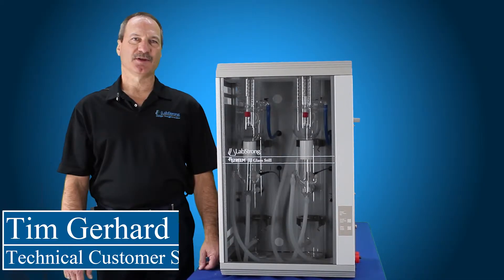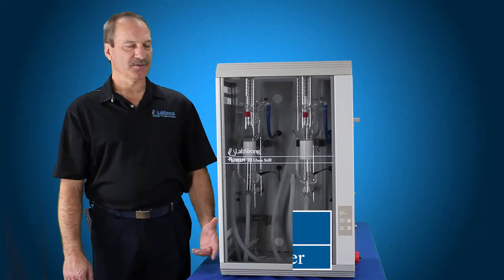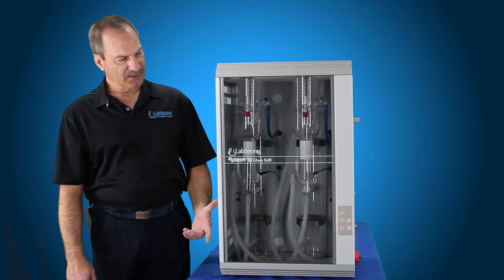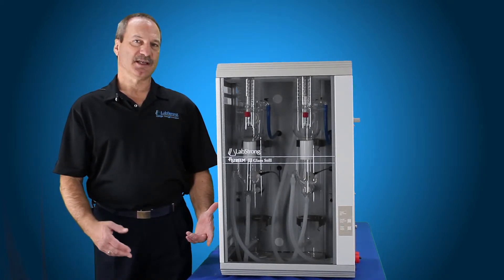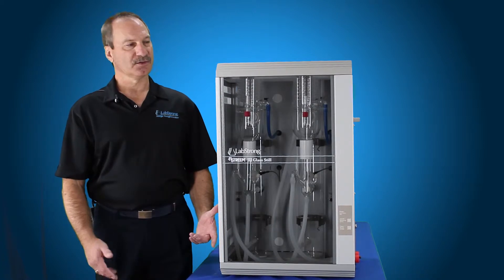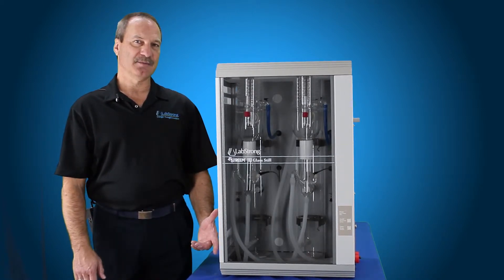Hello, my name is Tim Gerhardt. Today we're going to change out the inlet solenoid valve assembly for the FiStream 3. This is the 8 liter per hour system, but it's also the same inlet solenoid valve assembly that's used for the 4 liter bi-distiller and also the 4 liter system. That inlet solenoid valve assembly part number is PM0012-3.